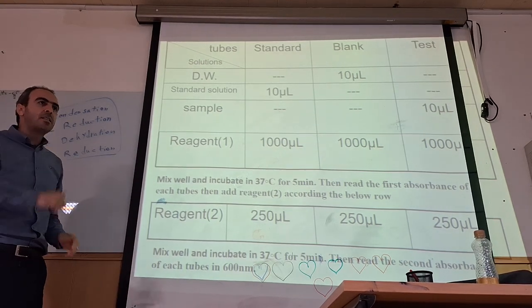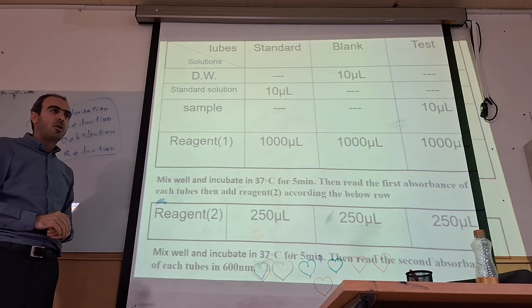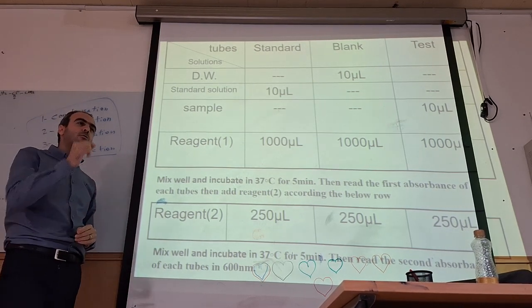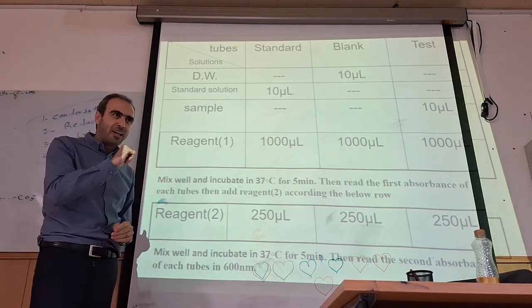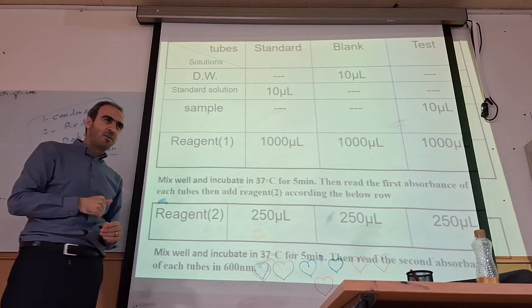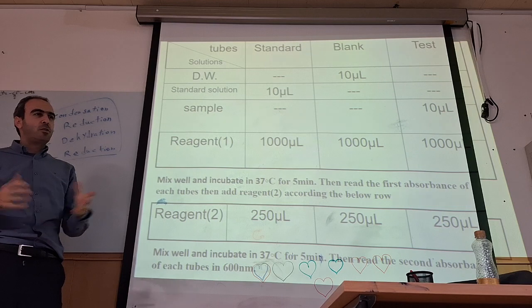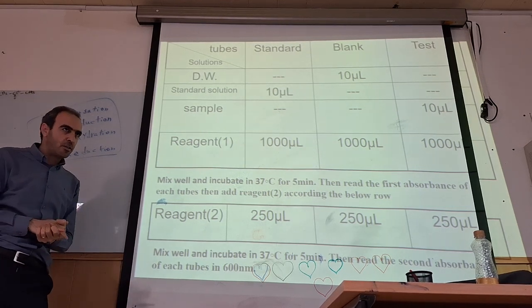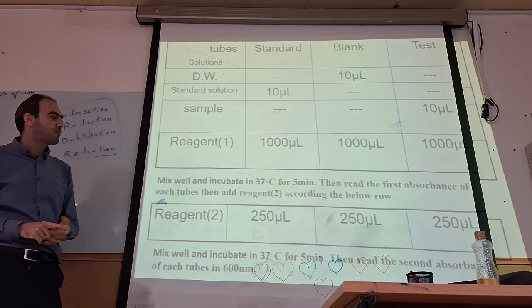No, we have a specific sampler for microliters. We have a specific sampler for 0.1 microliters also. I don't know if they have it, but they should have. We will check that together, don't worry. We can take a tiny volume. When we do molecular experiments, maybe 0.1 microliter we will add.